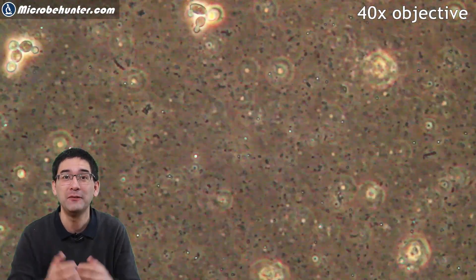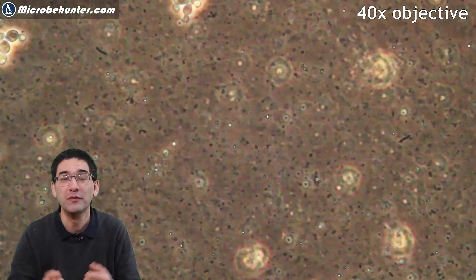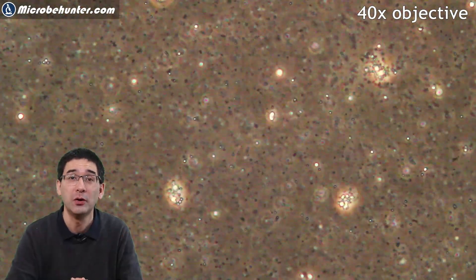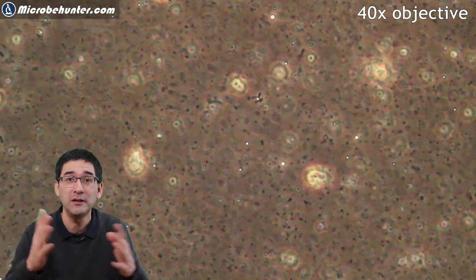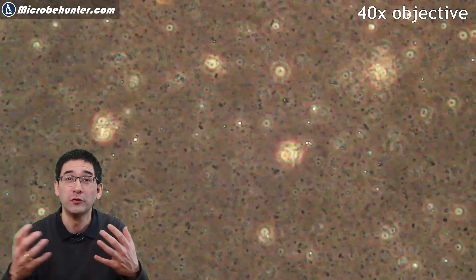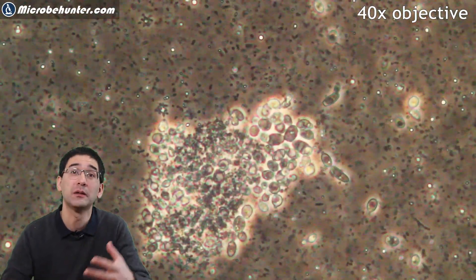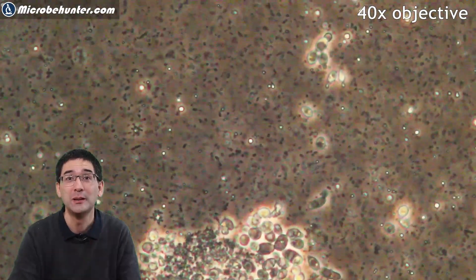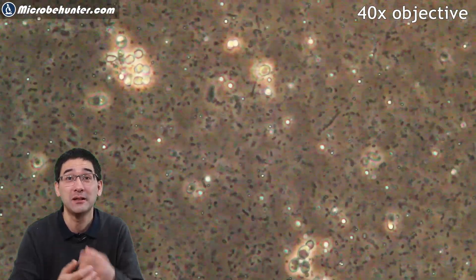Therefore, I used phase contrast. And in phase contrast, the bacteria become much more visible. They appear now dark on a slightly brighter background. I could also see the larger cells, which are the fungi, probably yeasts, which are also part of the kefir grain. Some of the bacteria were moving around a little bit. These are lactic acid bacteria and many other different species as well. They are essentially converting the nutrients in the milk to lactic acid. This makes the milk not only more storable, but because of the acid and the small amount of alcohol, it also gives kefir its typical taste.